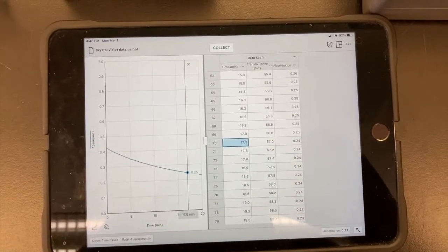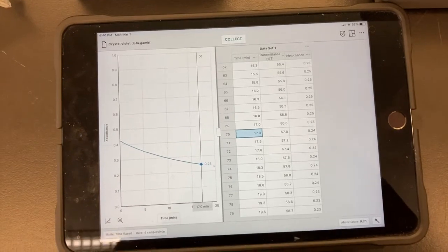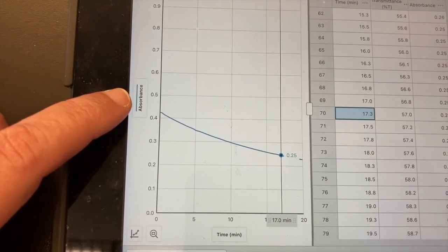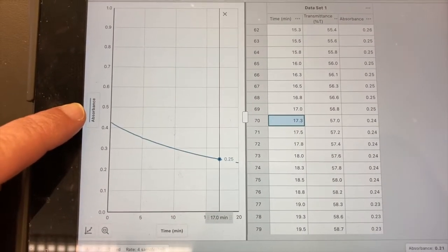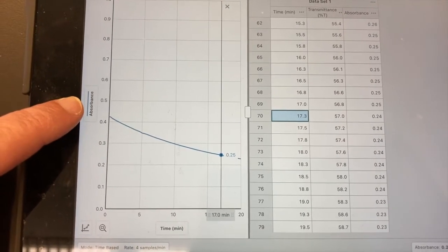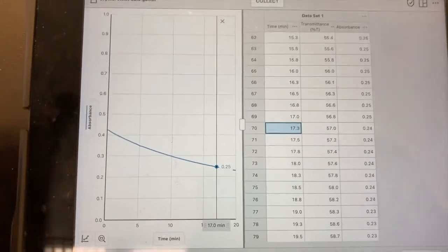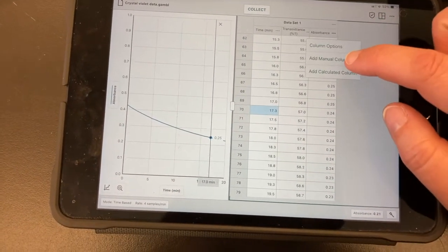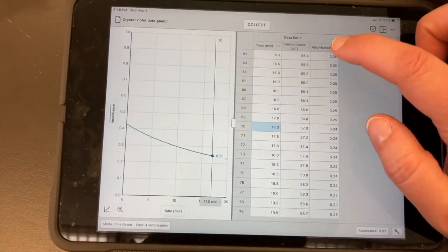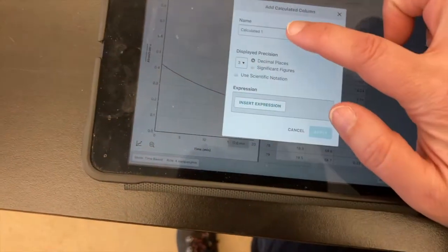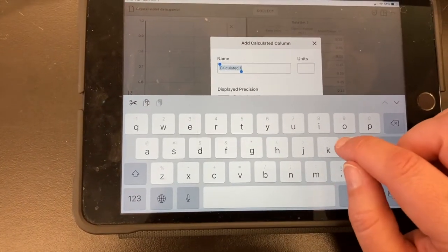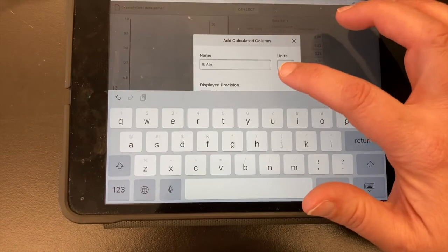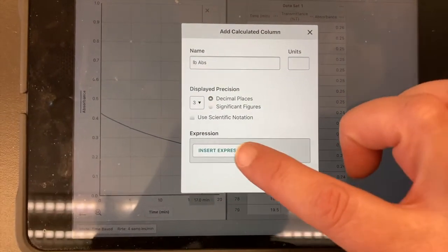And we want to do our order test. So we are going to need to look at absorbance versus time. And remember from our Beer's Law that the absorbance is proportional to concentration. So we are going to use this as if it were concentration versus time. So that is going to be our zero order test. And then we are going to need to do our first order test, which is the natural log of concentration versus time. So we are going to need to have the natural log of the absorbance. So we need to set up another column. So we are going to click these three dots next to absorbance. And we are going to add a calculated column. So this calculated column is going to be the natural log of the absorbance. And we are not going to put any units in.